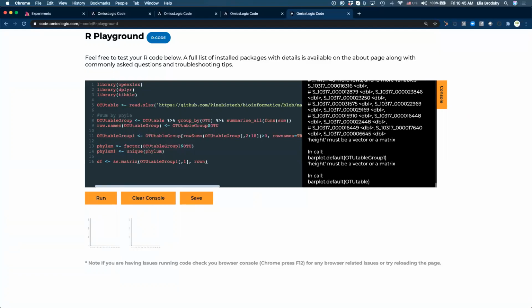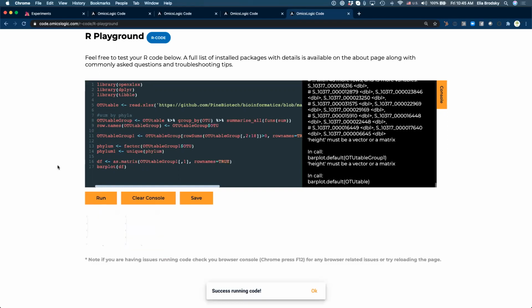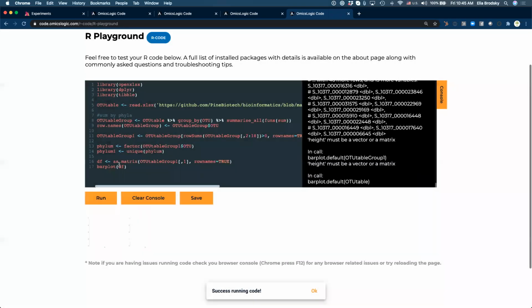And row names equals true. And now we can bar plot our OTU table group 1, or DF, right? Because we changed it. Okay, what happened here? OTU table group 1.